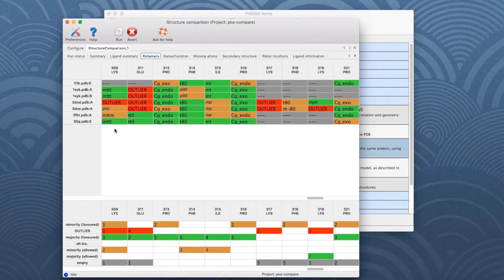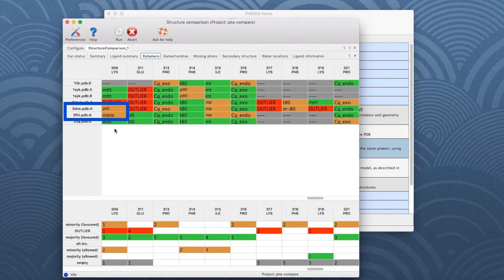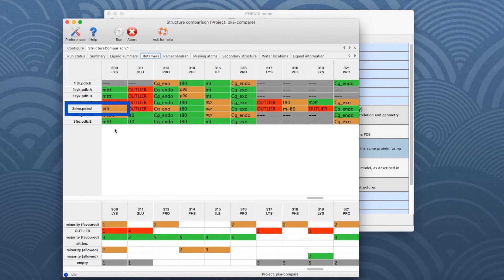Minority conformations are highlighted in orange, as for chain A in model 3FHI and 3DNE. Note also that the rotamer ID of the latter is written in italics, which means this is an allowed rotamer which only occurs in 0.3-2% of residues.